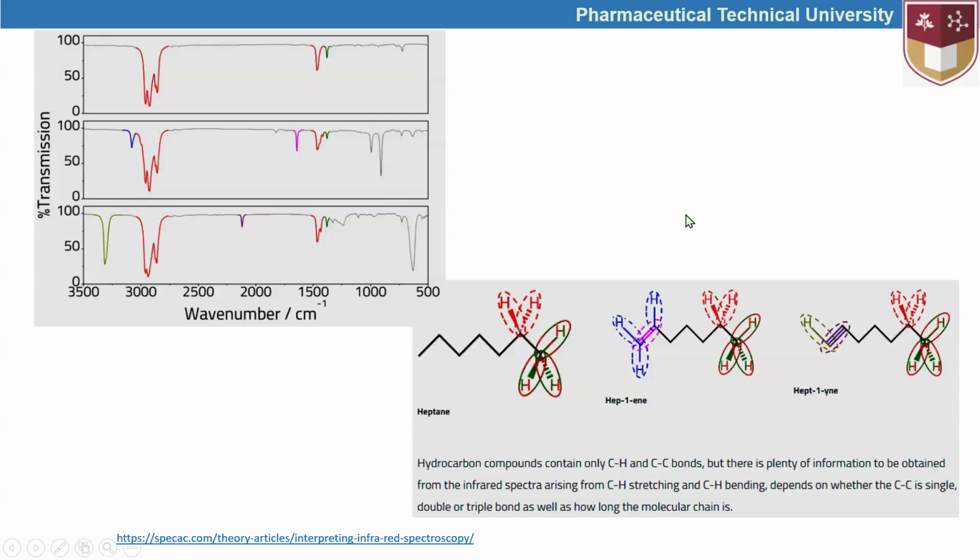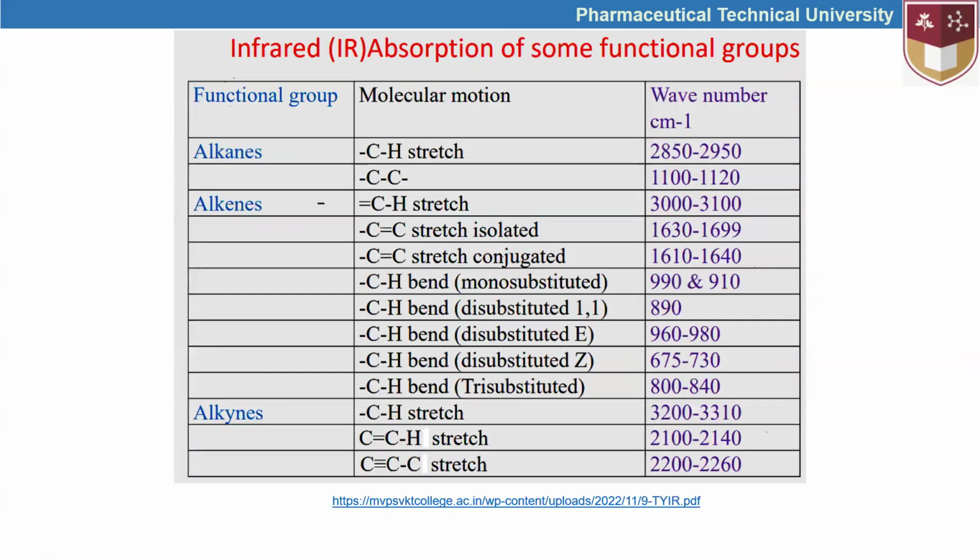So we have to develop our ability to compare the compounds with the references, as I try to explain. So then we can develop our skills to compare IR spectra, so then we can claim the presence of some functional groups in the given examples.